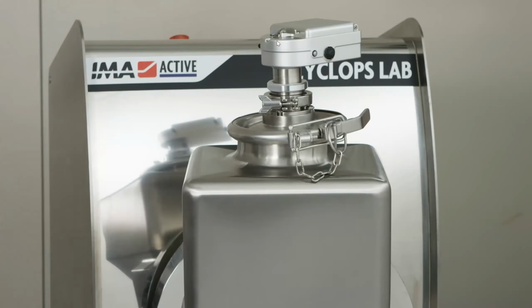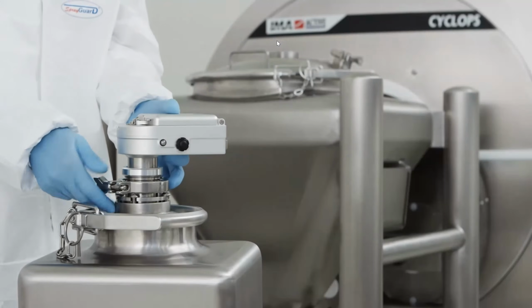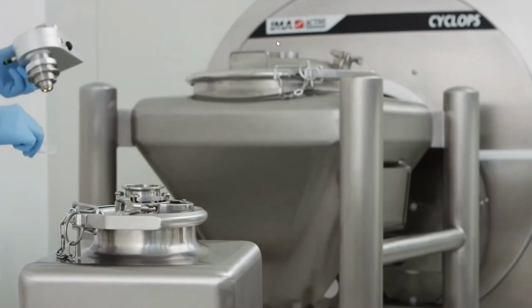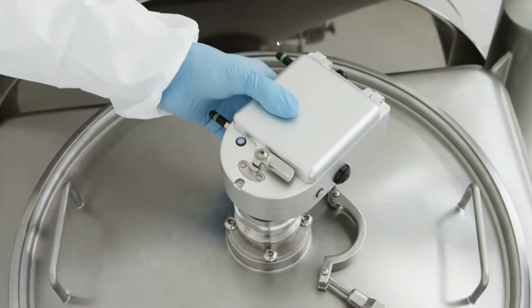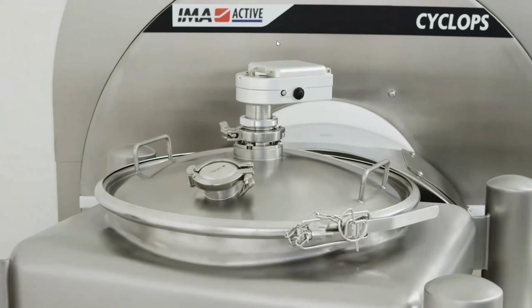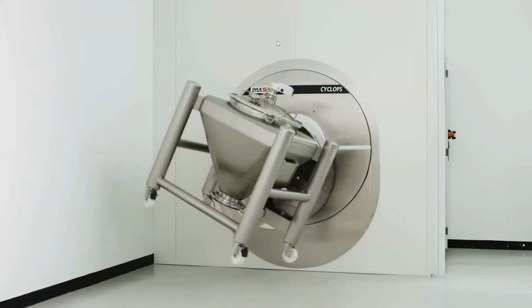The lid of the bin can be fitted with a dedicated flange on which the sapphire window is sealed. The 3-clamp connection is the easiest way to connect the sensor on the lid, while, once dismounted, room contamination is avoided. In this way, it is possible to use the same lid even if the NIR monitoring is not required. This strategic position on the lid allows high accuracy during the process monitoring, since the dead zones that can affect the reading are eliminated.